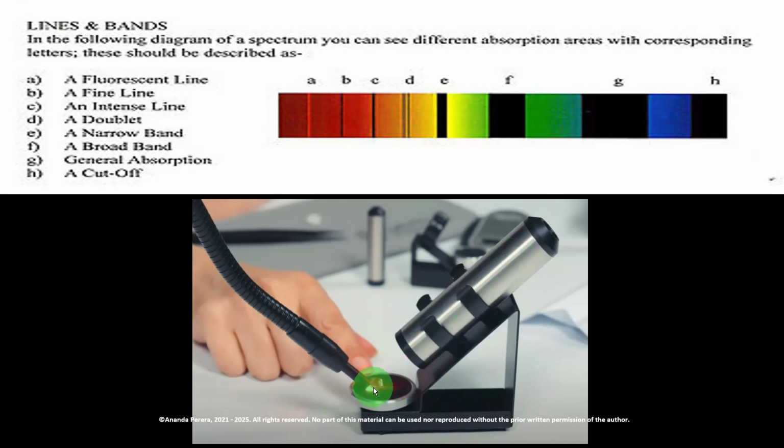You can use some clay or something to cover that area. Then you switch on the torch in your phone, and the light goes through only the stone. Then you can see it through this spectroscope.